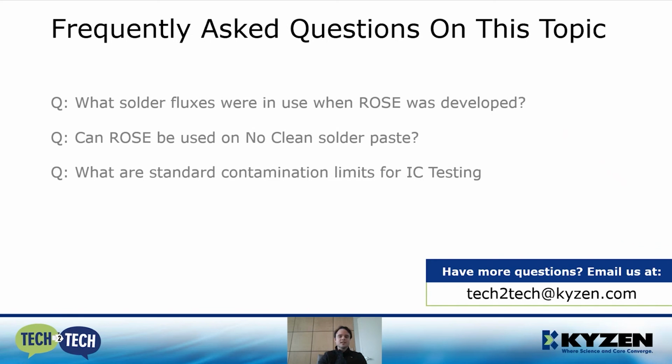Finally, what are the standard contamination limits for IC testing? The standard limits for IC contaminants are often different lab to lab and are usually process dependent. This concludes my presentation, and I'm going to hand it back to William.